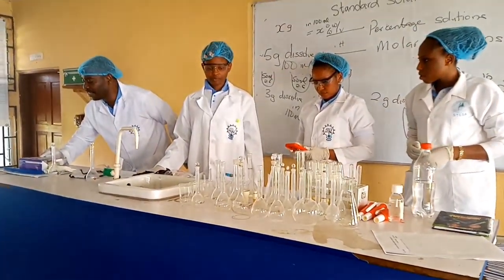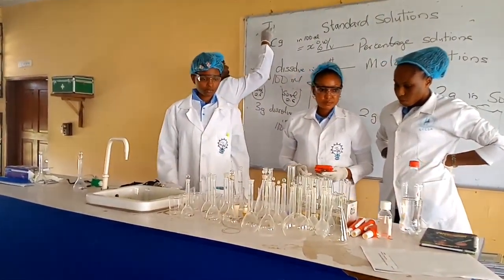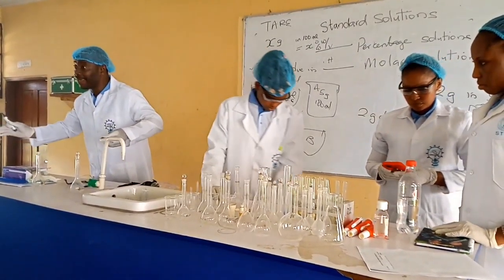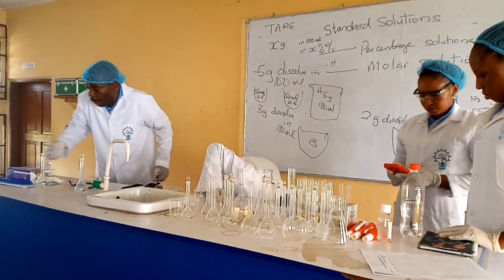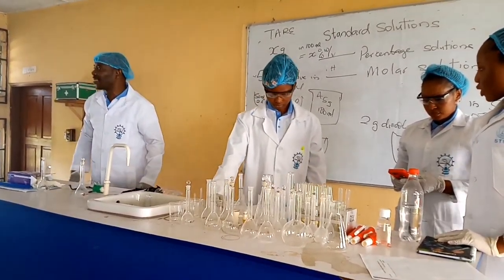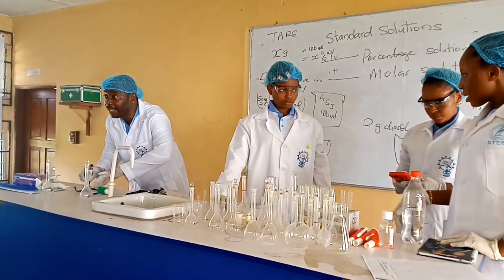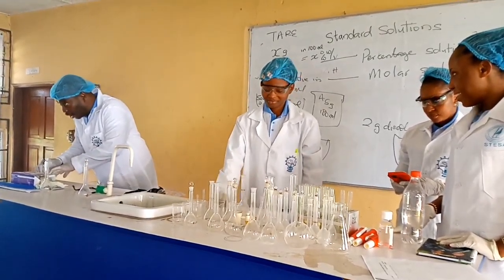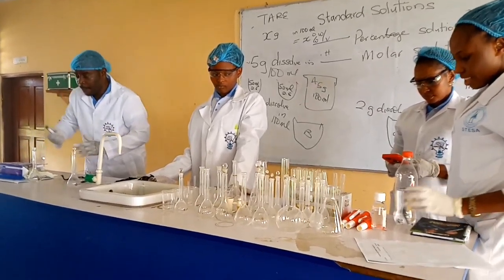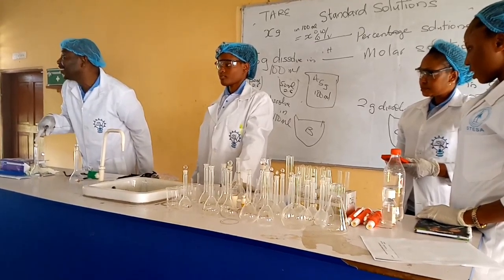So once you press this one, we call it TARE, T-A-R-E. What do you call it? TARE means you have zeroed the weight of that weighing paper. So whatever you now put on it is just the weight of what you are putting. But some machines don't have that part. So you are going to have to get a paper and write down the first weight. You call it the weight of the paper. Are you getting me? So when you now put something on this, you will subtract the weight of the paper from the weight of both of them to give you the weight of what you put.